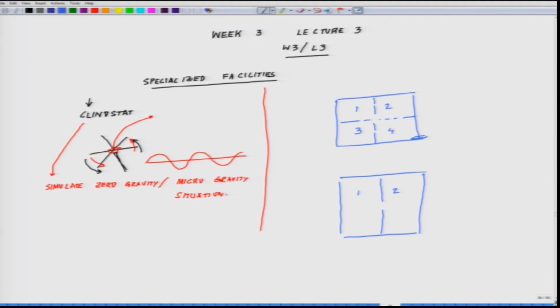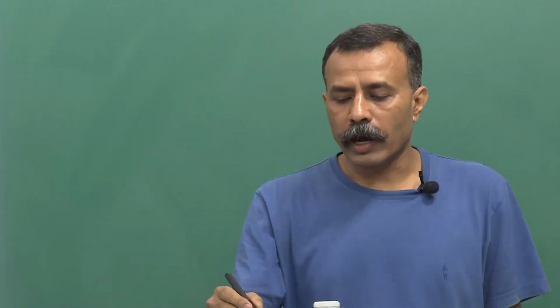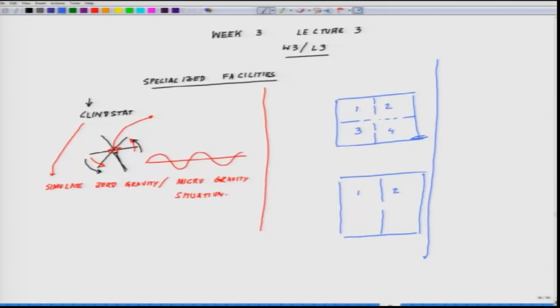in your basic manual to visualize what you are asking for. Whatever you are asking for, you are going to get that. But unless you do your homework right, you will land up in trouble. And what are the points you have to keep in mind? Again rehashing it, what is the number of users? This is very important. Second, what are their different areas of interest? So that will decide what all resources you will be needing, right?